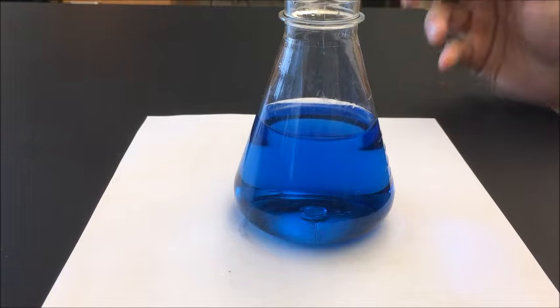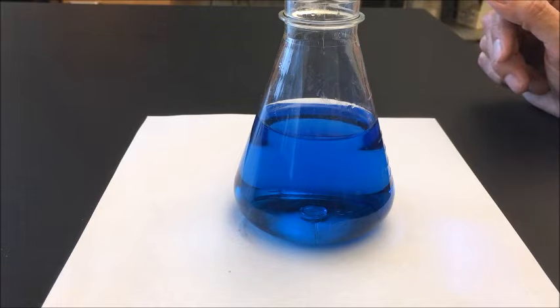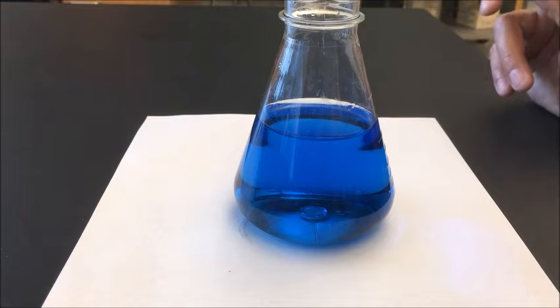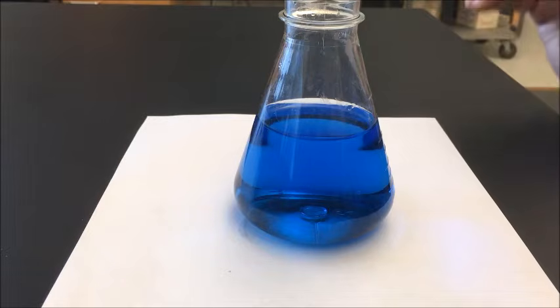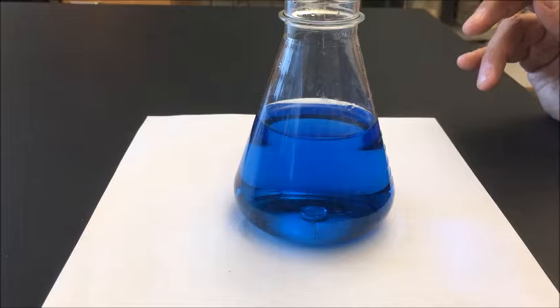So this is a flask with water and a blue chemical called bromothymol blue added to it. Now bromothymol blue is an acid indicator. So it's blue right now, but in the presence of an acid, it'll change colors.